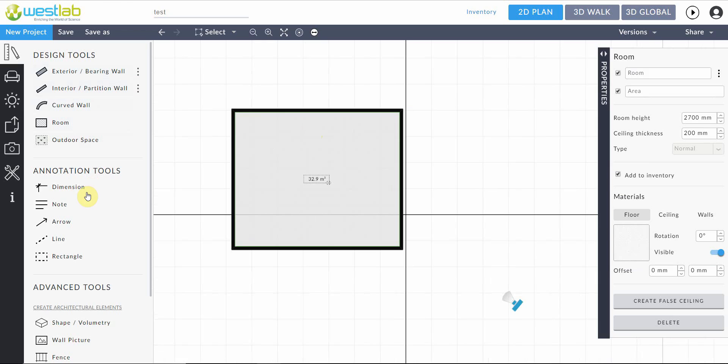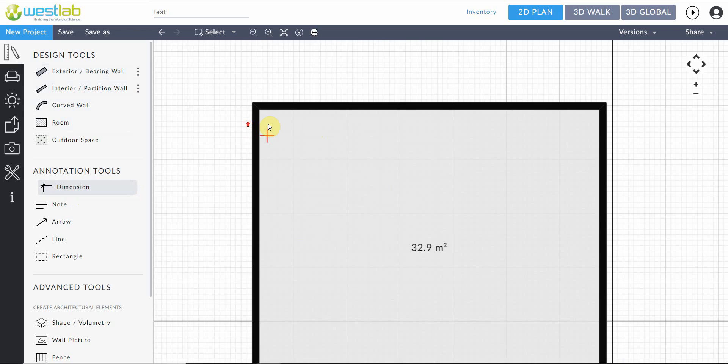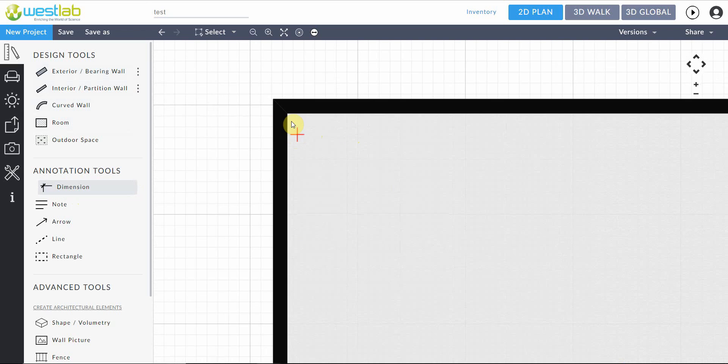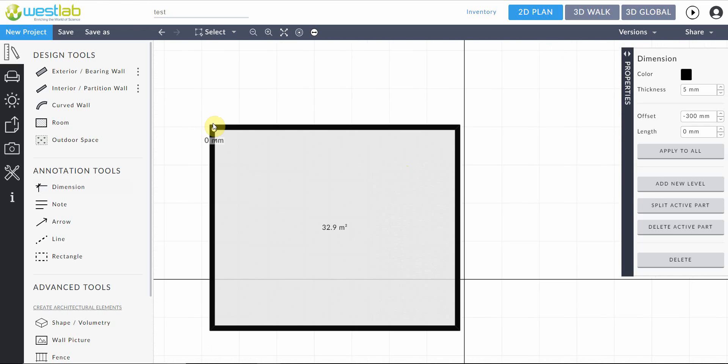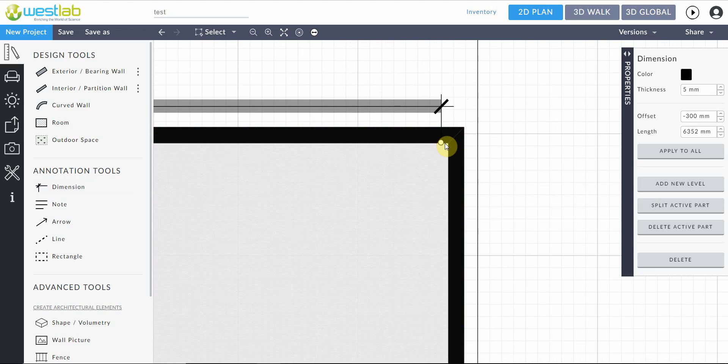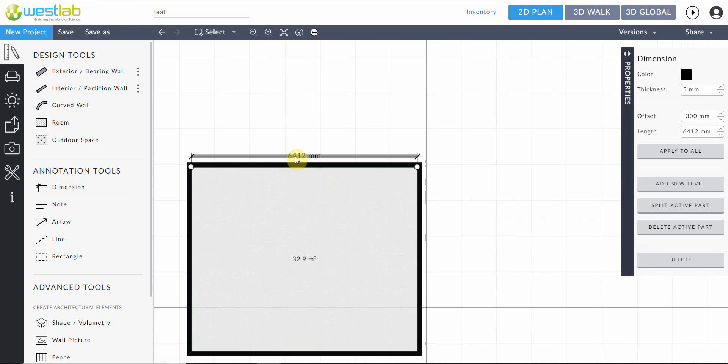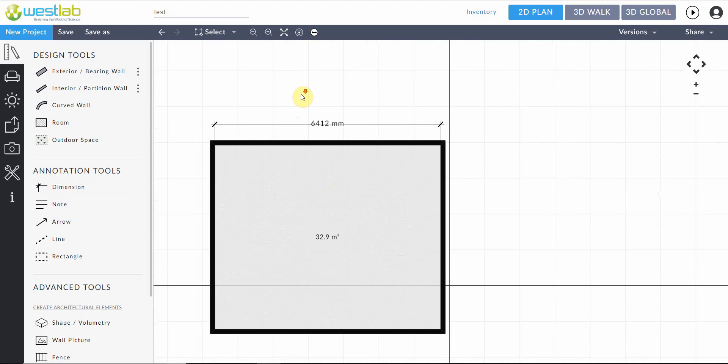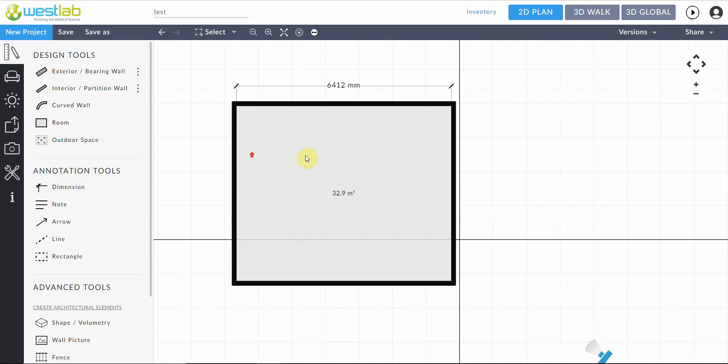Moving down we can see annotation tools. This takes us through basic annotation tools that we can use to add more information to our drawing. For example here I'm going to click on dimensions and we can scroll in on our plan just using our scrolling tool on our mouse. Selecting a point like so, then we can drag the dimension across to whichever point we desire to find out the length or the size of something.